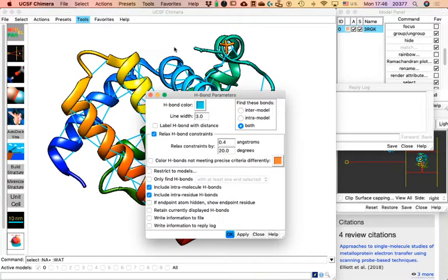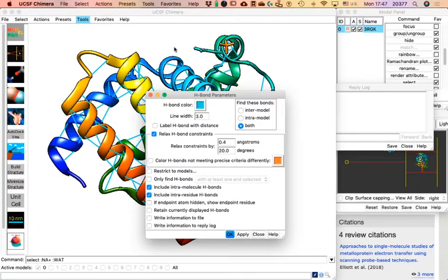Just like other programs, Chimera has a set of default things it does when you open it — so maybe yours is set up to calculate hydrogen bonds even before you ask it to. Did you get a hydrogen bond number? That's what matters. Before the class ends, I'm going to close that and show you something.